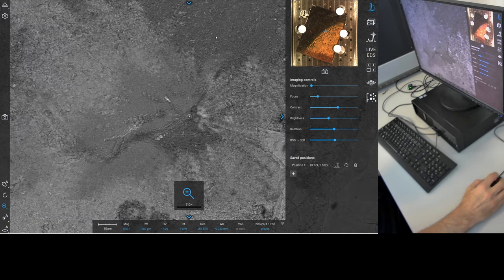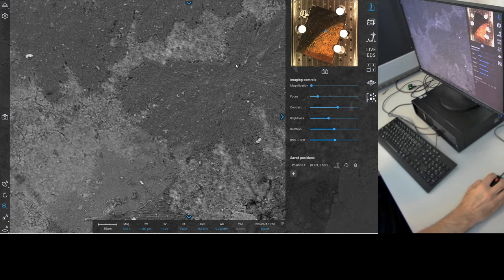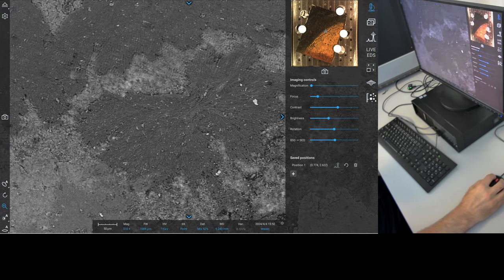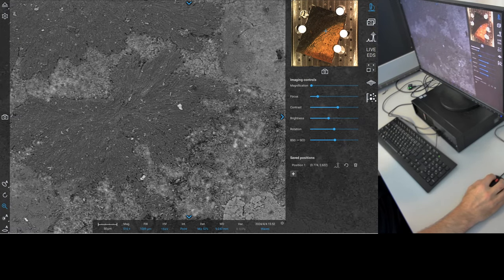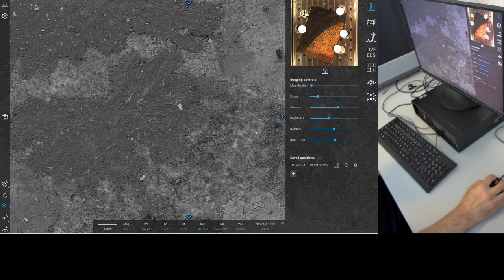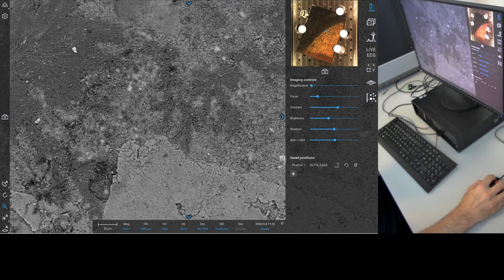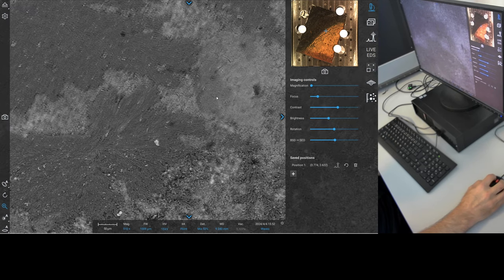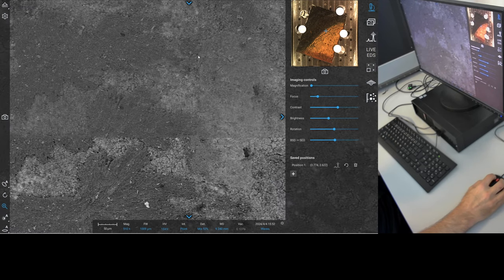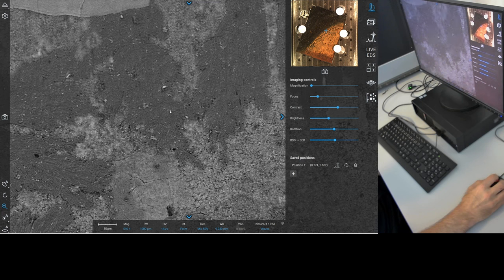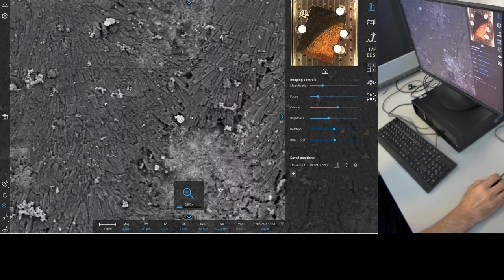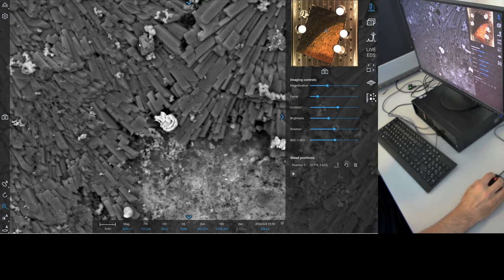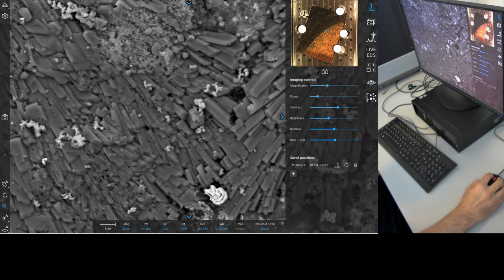All right. Tomorrow I will be here with you until six. I like the sound of that. We've got till six tomorrow. Great. Where do we want to go on in one of these sulfate structures? It's going to be near the end of them. Let's look for a fairly big ball. That one looks like a lot of debris on this. No, that's your cutting debris, metal debris.